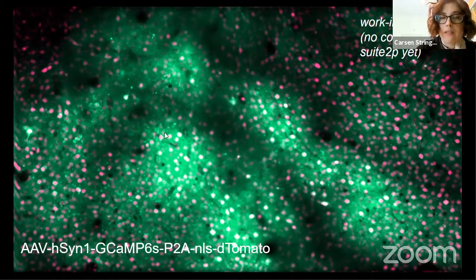And so we have these, you can see the pink, I did it in pink and green, and you can see lots of these cells. So every cell that has activity should have a pink circle. There might be pink circles without activity, maybe because the GCaMP didn't express so well, but it means that we have a ground truth now that every cell that has activity should have this pink blob in the middle.